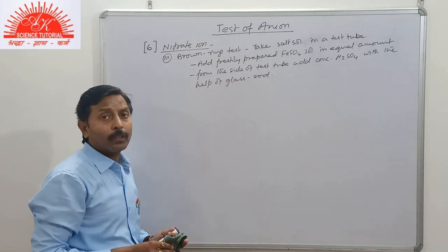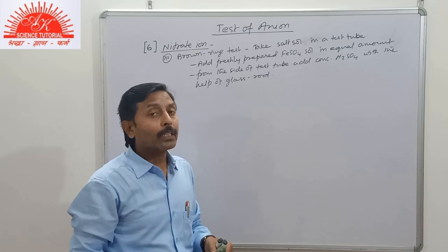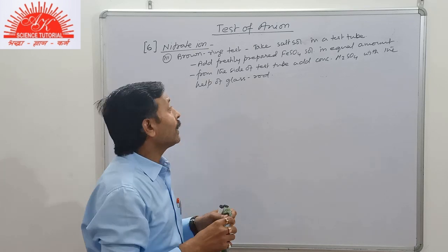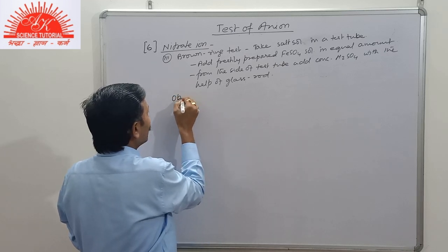Conc H2SO4 reacts highly exothermically with water, so it is not added directly but dropwise through the wall. Now, what is the observation?